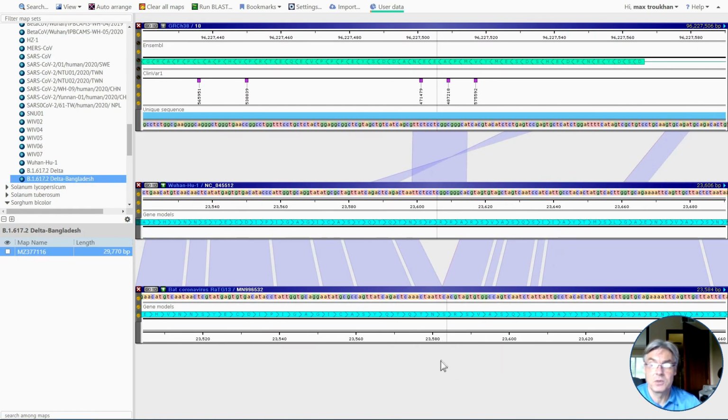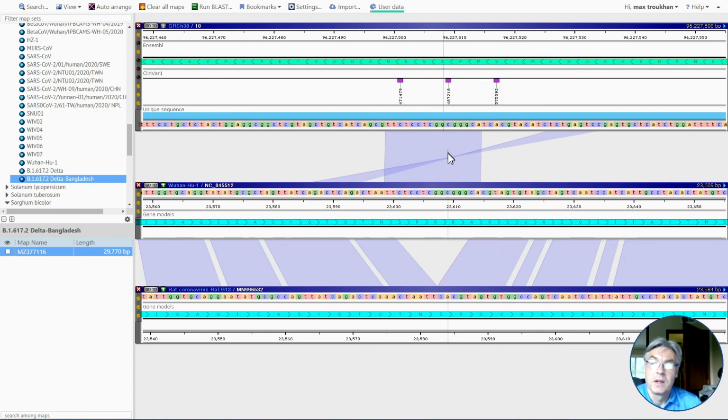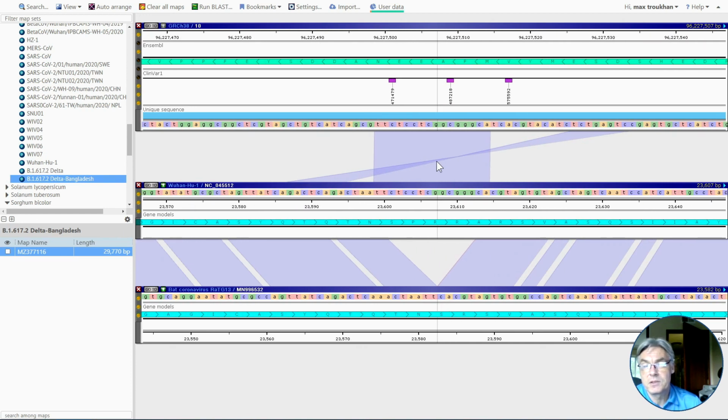If anybody knows this stuff, my theory was that the mRNA from this gene will be antisense matched to the mRNA of this gene, and could it silence it? Or the question is who is silencing whom, but I think the number of copies of mRNA from the virus is higher than this one for human. I don't know, but it looks interesting.